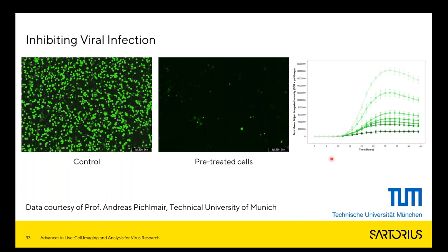So this really nicely shows that functional assays related to virus work can also be performed on the Incucyte system.